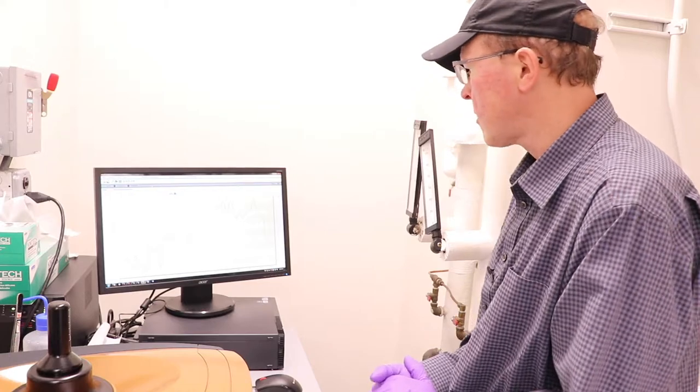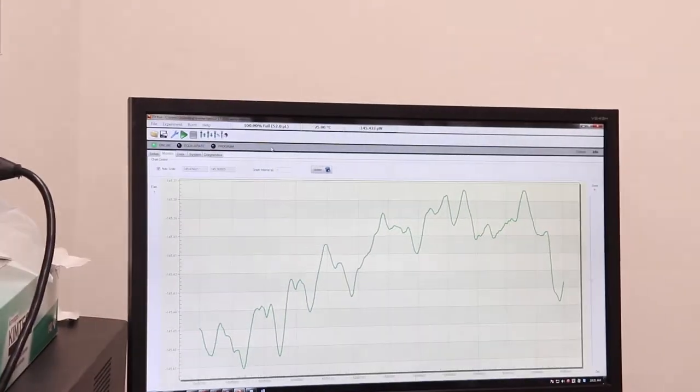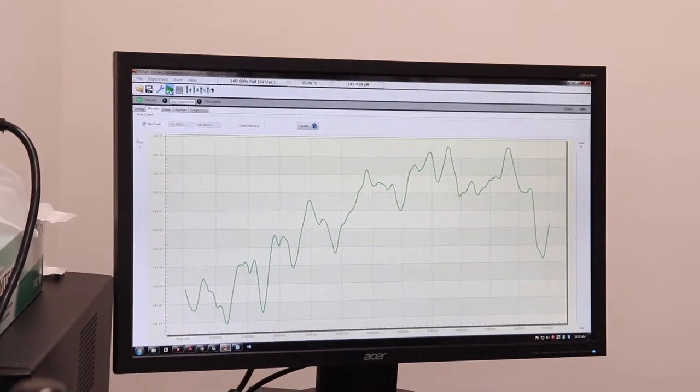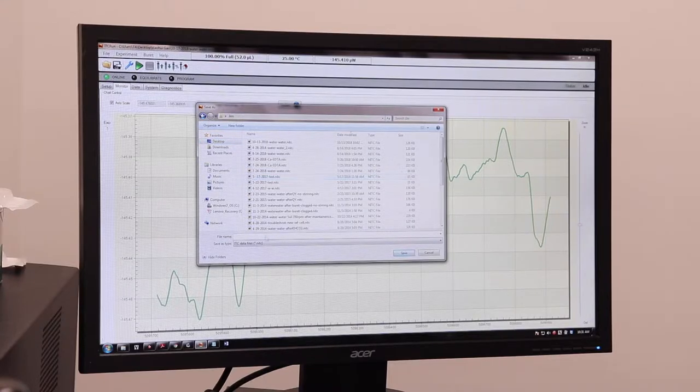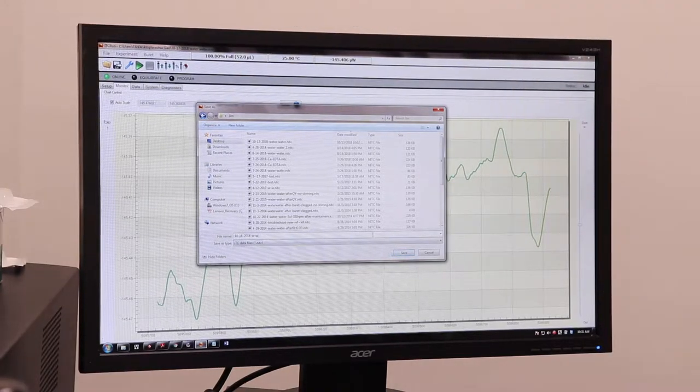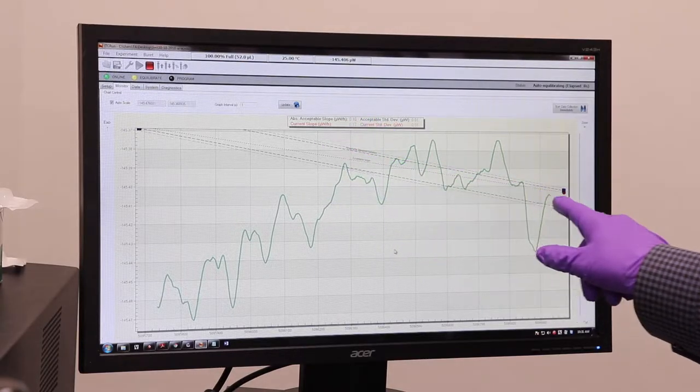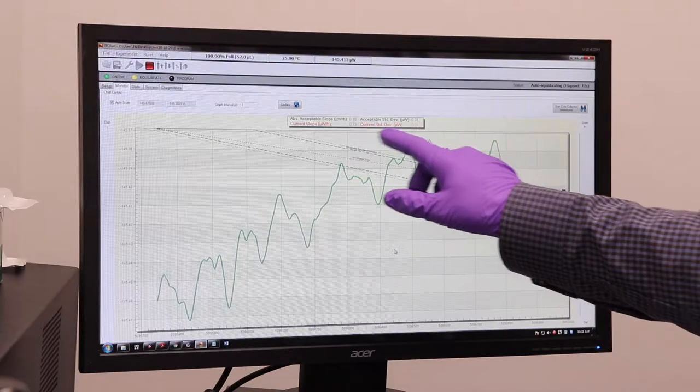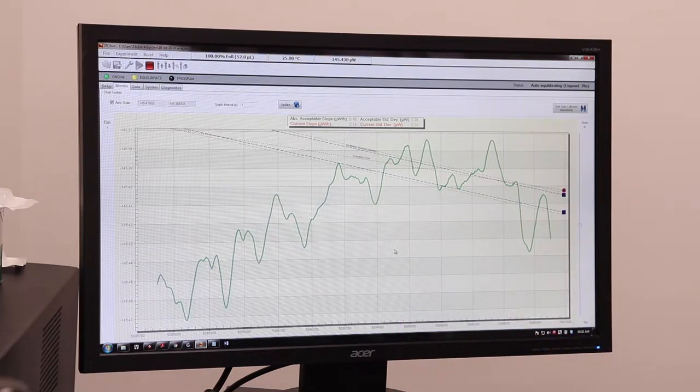So after about 20 minutes, we start it and then we can watch the auto-calibration. Okay. So we've waited about 20 minutes. And we can see from the monitor that has set an auto scale that the system is pretty calmed down. There's not a lot of heat changes. So at this point, I'll start the experiment itself with this green button here. It's going to prompt you for a file name. So typically make a folder on the desktop. It's going to have all your stuff in it. And you'll see the auto-calibration statistics will come up with this. And this is how it calculates it.